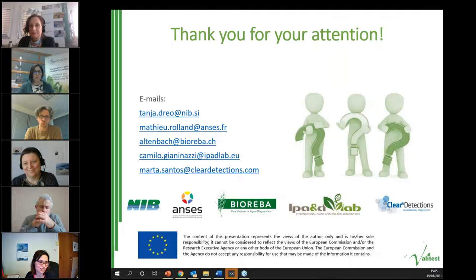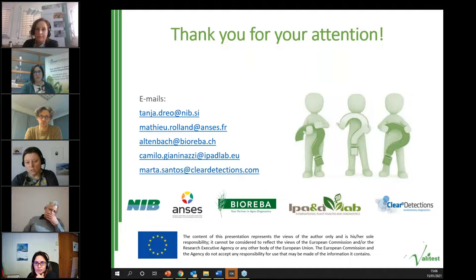This is a very good question that we are all struggling with. Again, there is no single answer. The minimum requirements in, for example, EPO guidelines require you to determine these diagnostic parameters on a certain number of spiked samples, etc. But of course, as a laboratory, you want to check how the test performs also on your routine samples. I can share our own approach.